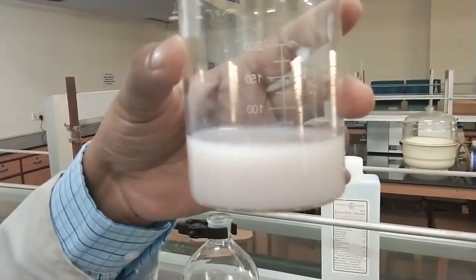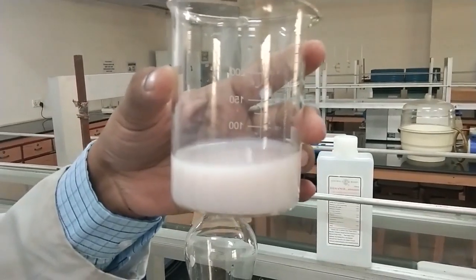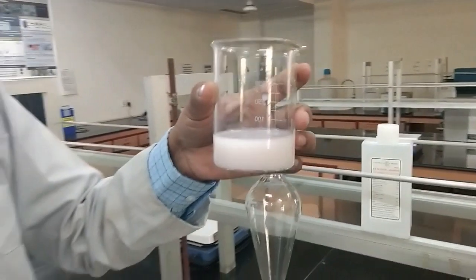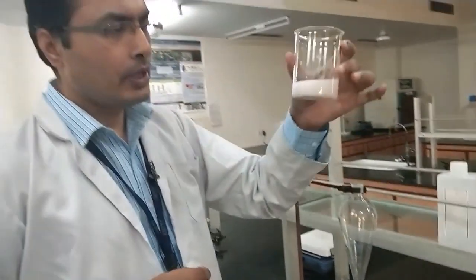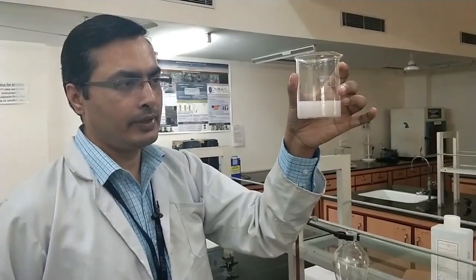In order to make even smaller particles, you can prolong the addition of iron into this and that will make even smaller sizes. As you can see, it is not settling down, so it is a colloidal solution of iron pyrophosphate. Thank you.